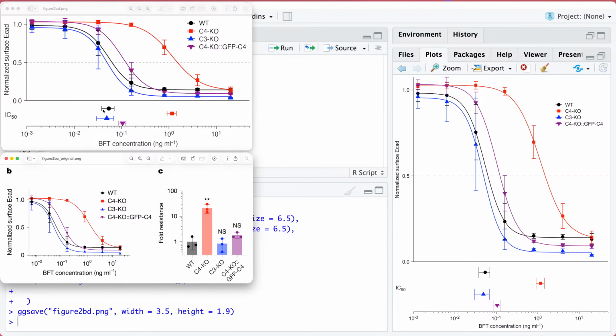And there now we have the same order from top to bottom that we have up here in the legend. Okay.